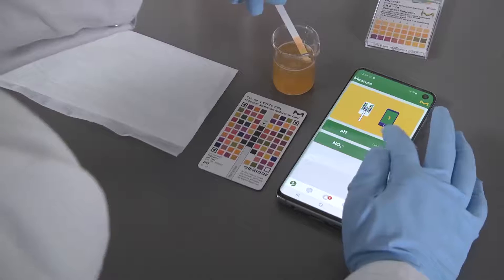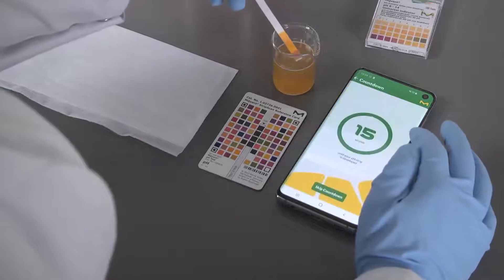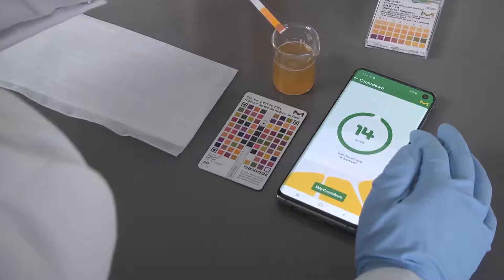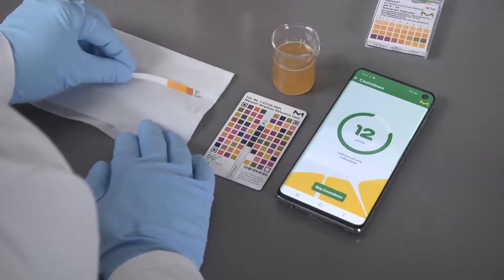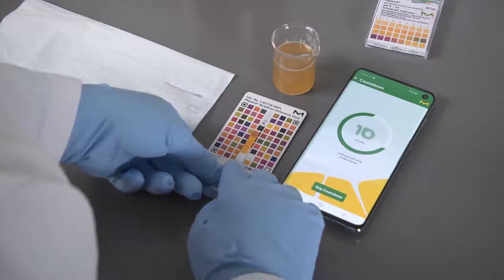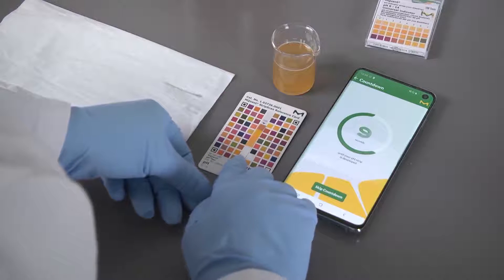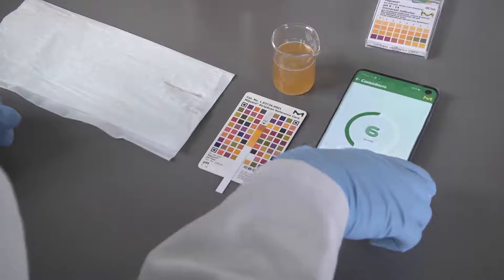Simultaneously dip the test strip into your sample and select the appropriate parameter on your phone. This triggers a countdown which ensures the correct reaction time for each parameter. Now place the test strip on the reference card.